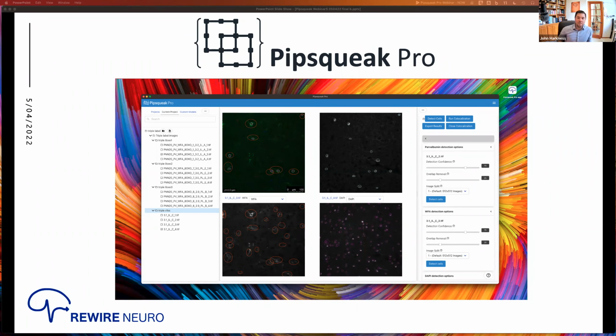Great, yeah. So welcome to today's webinar. We are going to talk a lot about Pipsqueak Pro and what this can do for your image analysis. Pipsqueak is something that we've been developing for a long time, and it's gone through a number of different versions. So part of what we'll talk about today is just some of the differences between the versions that are out there. But this is great to see a lot of new faces.